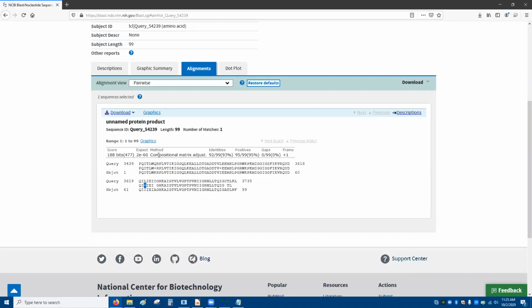Pluses are considered minor errors. So in this case, there's a leucine and an isoleucine, which basically have the same molecular weight for the most part, and they're both nonpolar groups. So having that in there is not going to greatly affect the function of the protein, theoretically.